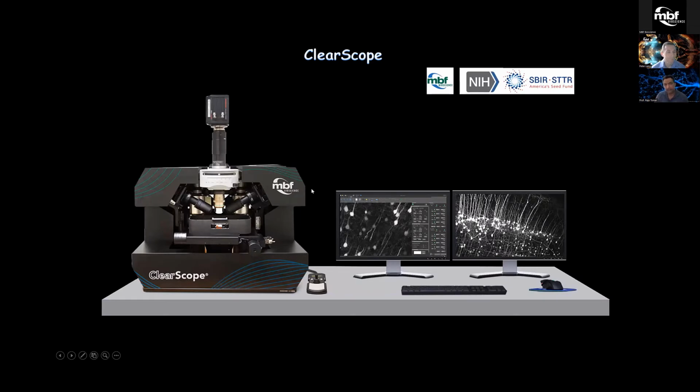So that's the implementation from MBF Biosciences that they call ClearScope. It's really nice, fantastic, robust. We helped them in the context of this NIH SBIR grant, and as part of that, we also fortunately got a first prototype of the system that we have been playing with and having fun with, and now we're regularly using it for various kinds of applications.